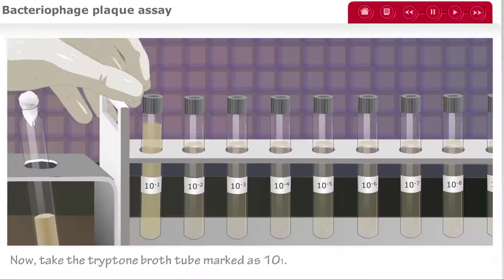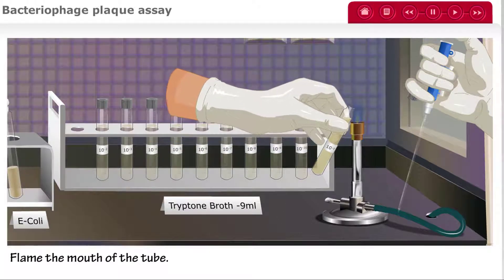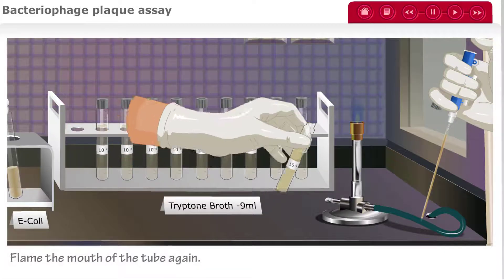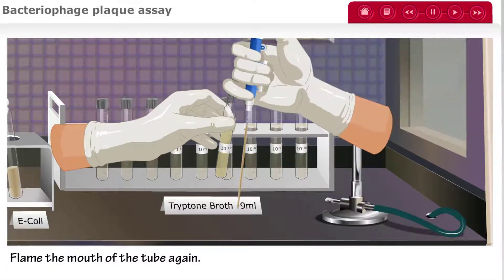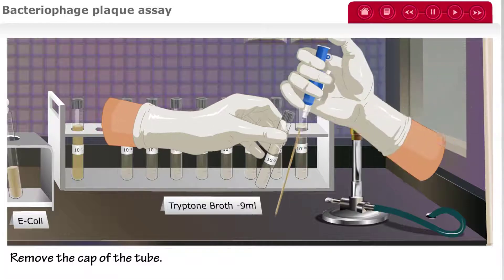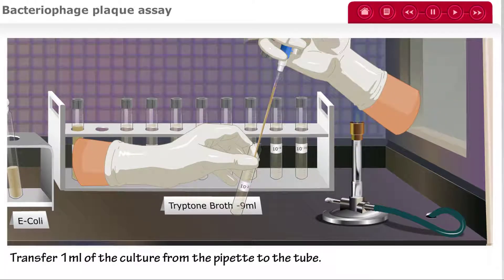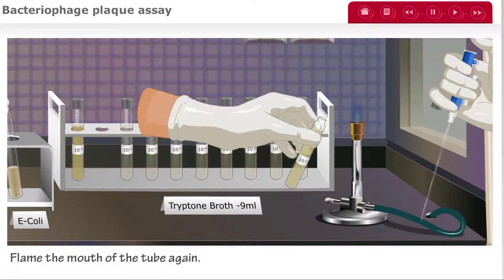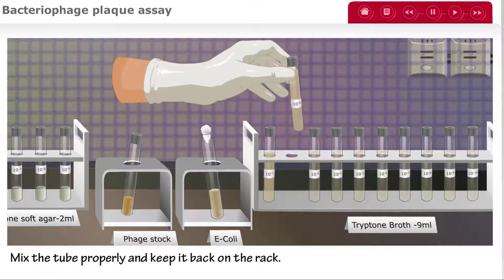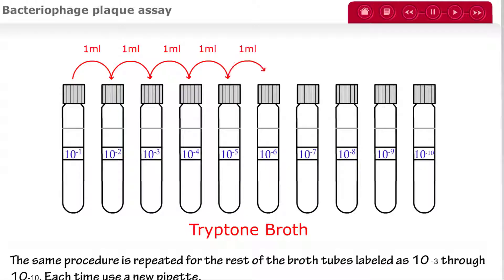Fix a new sterile pipette to the pipette pump. Take the tryptone broth tube marked 10 to the negative 1, remove the cap, and flame the mouth of the tube with the Bunsen burner. Take 1 mL of culture from the tube using the pipette. Flame the mouth of the tube once again and replace the cap. Now take the tryptone broth tube marked 10 to the negative 2, remove the cap, and flame the mouth using the blue portion of the Bunsen burner's flame. Transfer 1 mL of culture from the pipette into this tube, flame the mouth again, replace the cap, and mix the tube properly before placing it back on the rack.